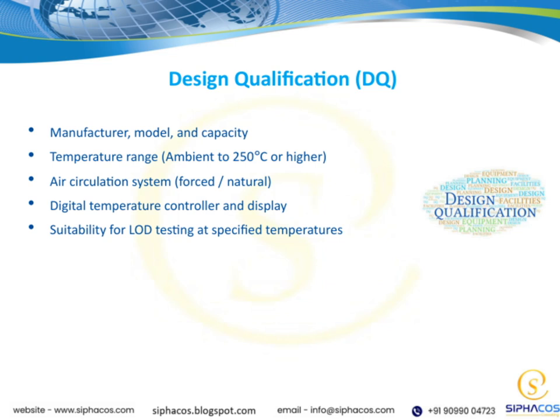Finally, the equipment must be suitable for LOD testing at the designated temperatures. This means it should meet all the necessary specifications to reliably perform tests at those temperature levels, ensuring the integrity and validity of our results. All these points connect back to our overall goal, making sure we have a reliable, accurate, and compliant testing environment.